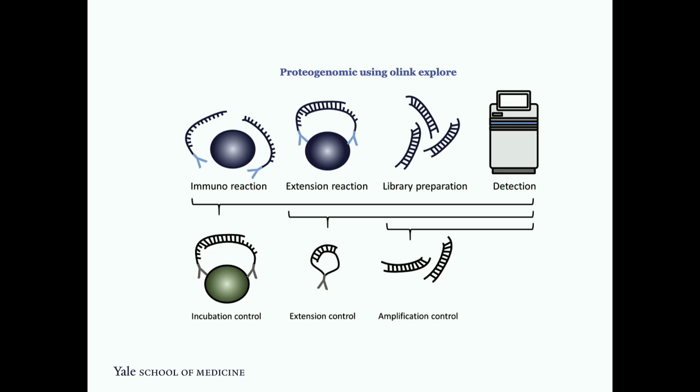Maybe complementary bases are less? No, it will not, very few. That is the innovation there. That is how the whole reaction is optimized in a way that just antibody-based pairing should not happen, and that is done through controlling the salt concentration in the solution.